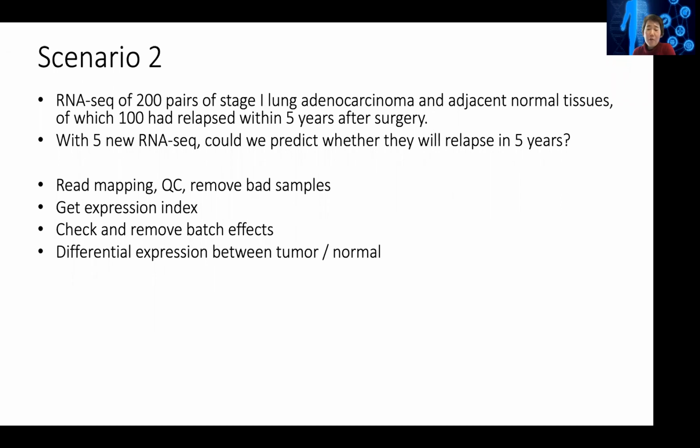Yeah, so one thing you might want to check is the differential expression between tumor and normal, because they already give you some difference, because individuals are still quite different after all. And so you could consider running the PCA based on the differential expression, because with the differential expression, you actually get the score from DESeq on all the genes, even if they are not differentially expressed, right?